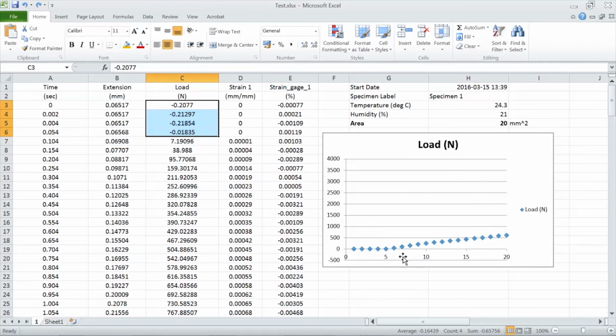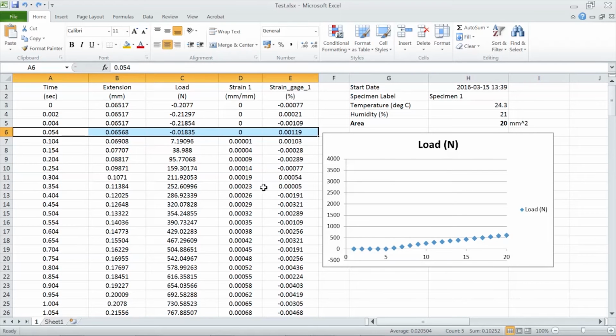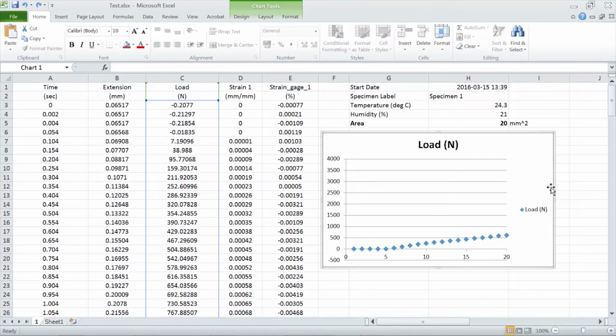What we do, we actually take this point. You can see here it's number 5 in this case. Well, actually it's this point here, 7.1. This is the first point which has some meaning. So in that case we would call this one a 0 value. Okay. So basically I will now take the curve and shift it from this position to here and assign this to 0. But how to do it in the right way? Well, this is what I'm going to show you right now.